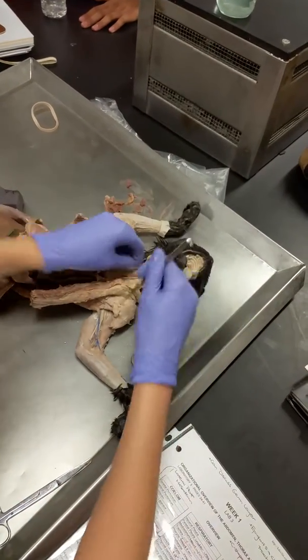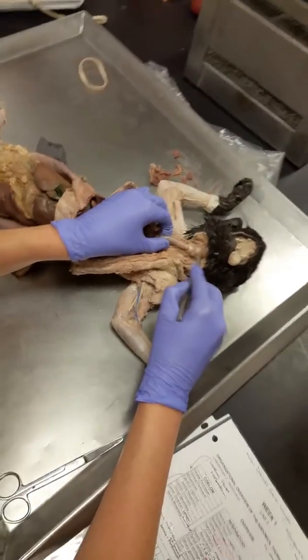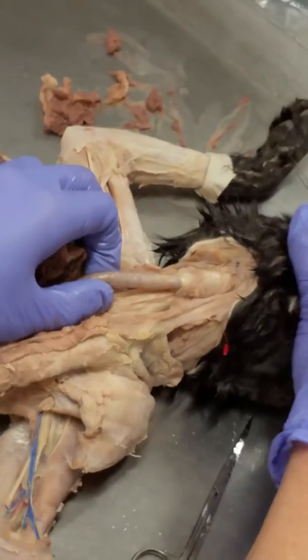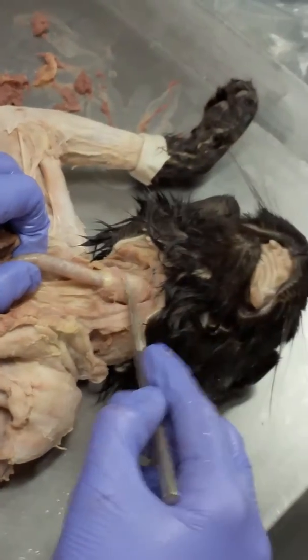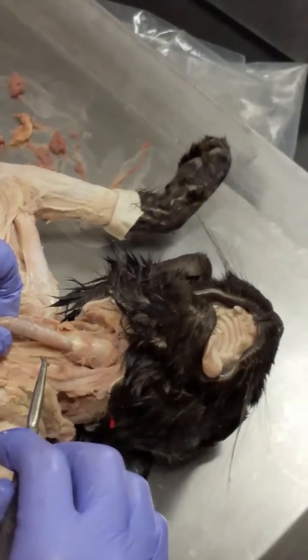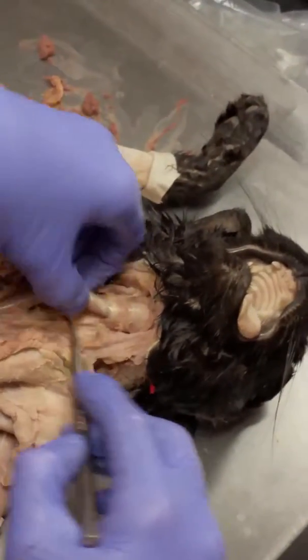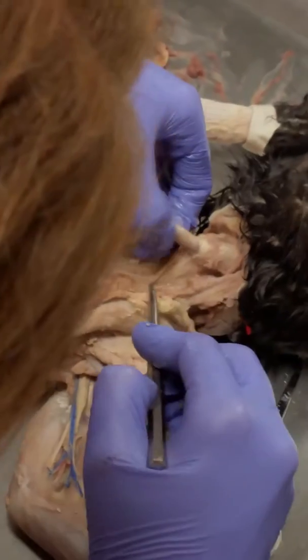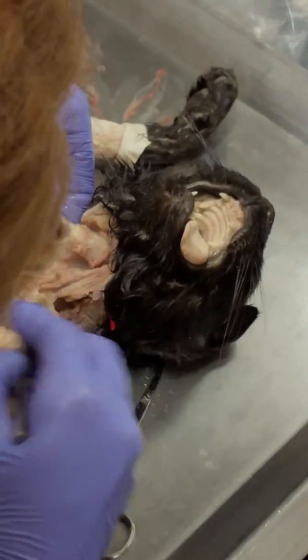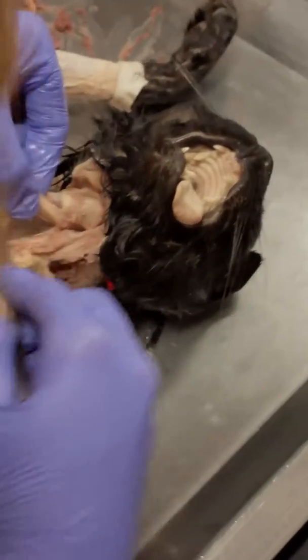And up above the trachea, there's some cartilage here. This bit of cartilage right here. This is thyroid cartilage. Okay, so right there, this is thyroid cartilage here. We'll do cricoid later. And then underneath of the trachea is another tube, but this tube is flat. This tube is the esophagus.